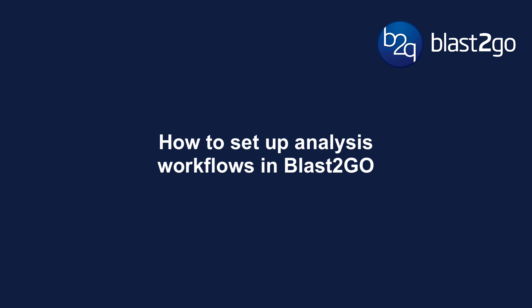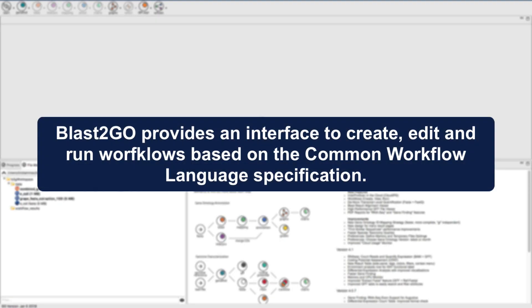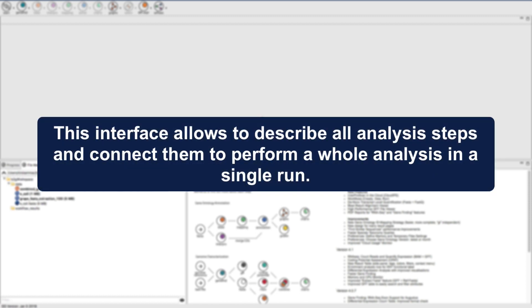How to Set Up Analysis Workflows in Blast2Go. Blast2Go provides an interface to create, edit, and run workflows based on the common workflow language specifications. This interface allows one to describe all analysis steps and to connect them to perform a whole analysis in a single run.